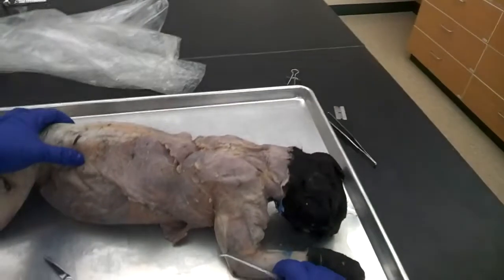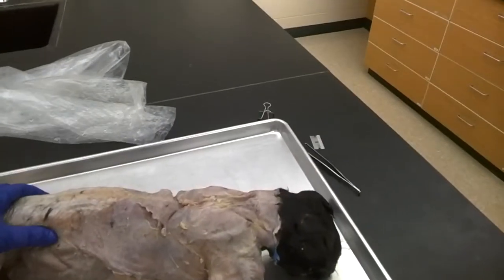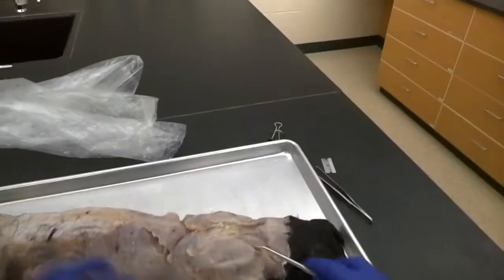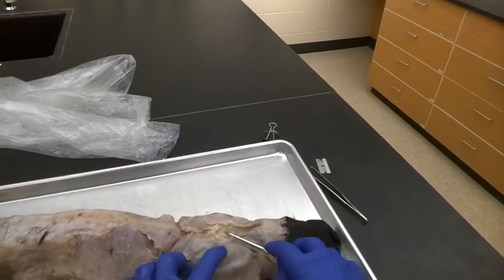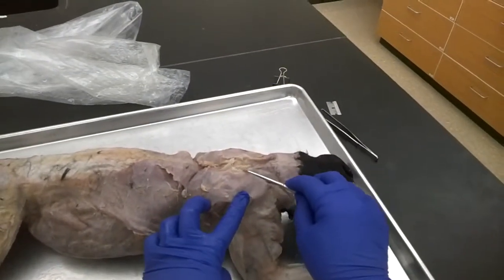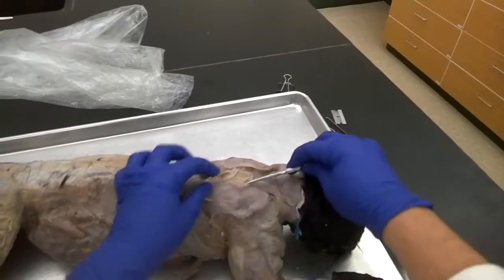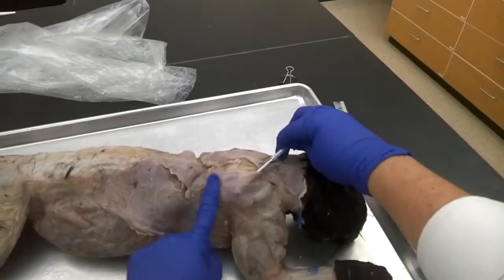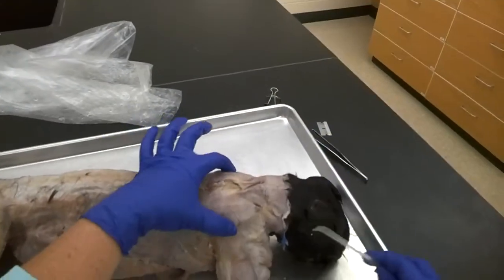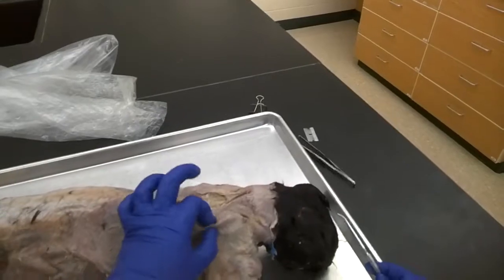The next two muscles on the back are the acromiotrapezius and the clavotrapezius. These are slightly easier dissections. For the acromiotrapezius, we've already made a cut or incision into the back between the scapulas and used that to separate the muscle off the surface of the scapula. This thin sheet of muscle is the acromiotrapezius — our landmark is the middle of the shoulder blades, and it's that thin layer of muscle on either side.